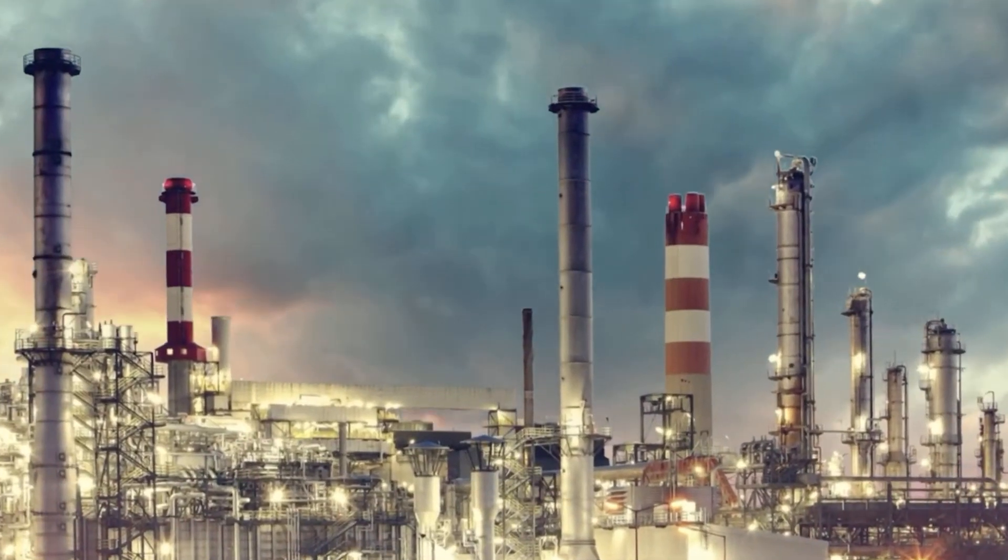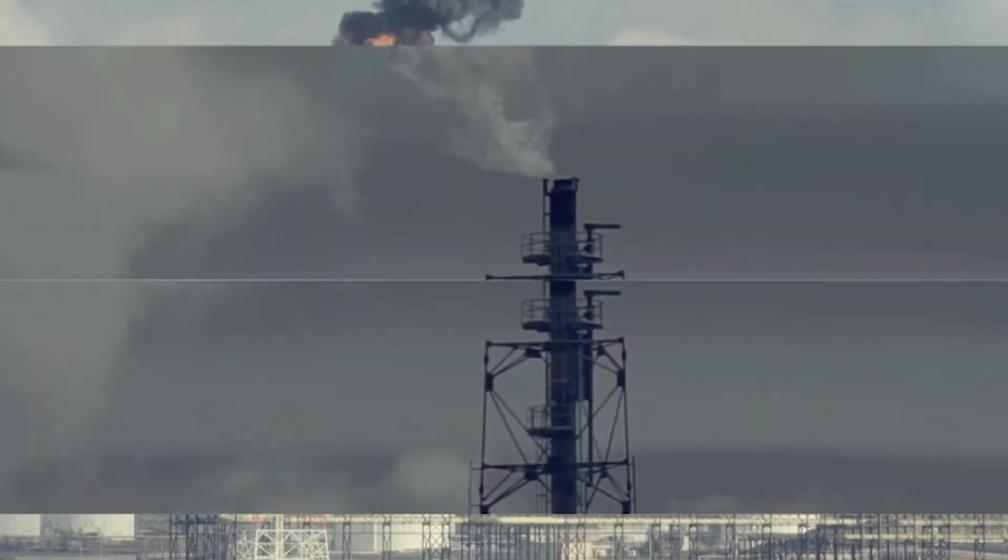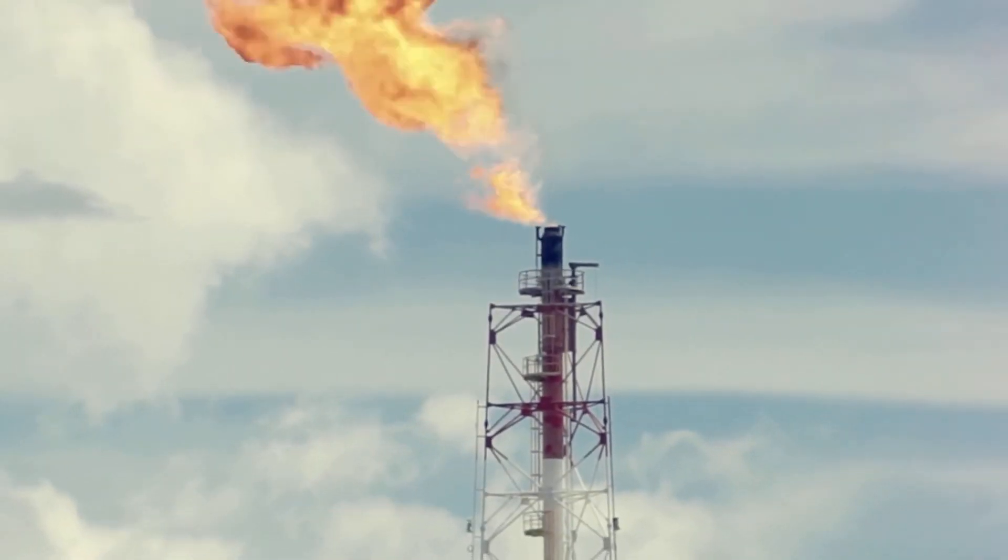National and local governments require processing companies to monitor their plant stack emissions and flare gas streams to reduce the amount of pollution entering the atmosphere.